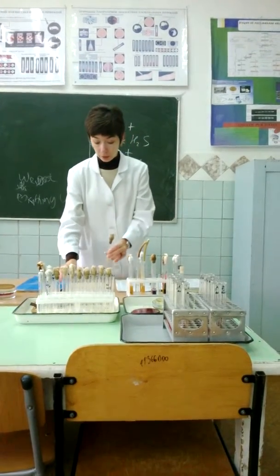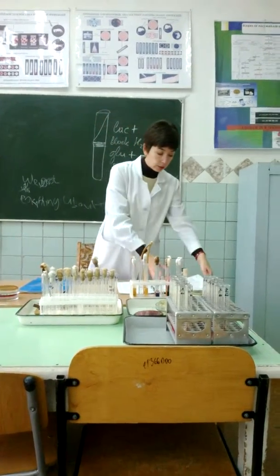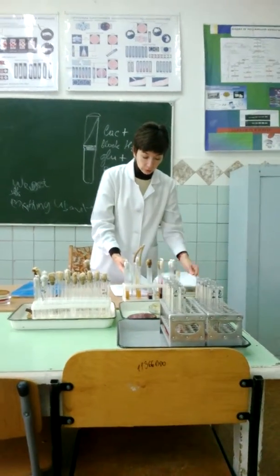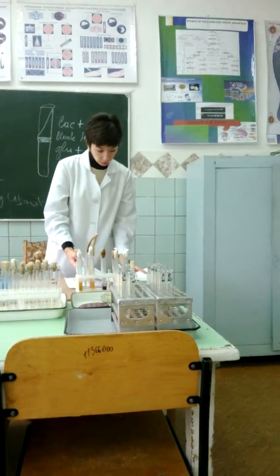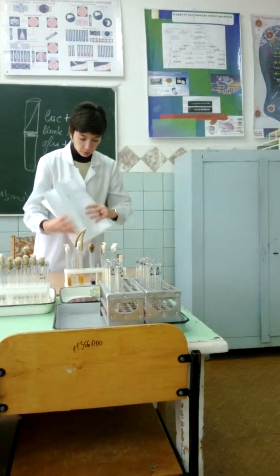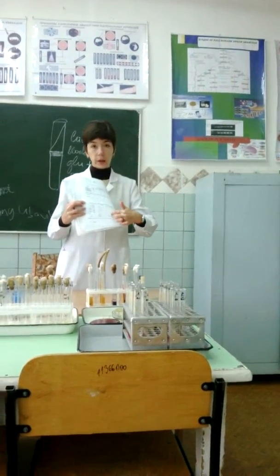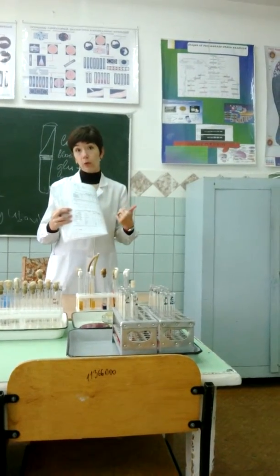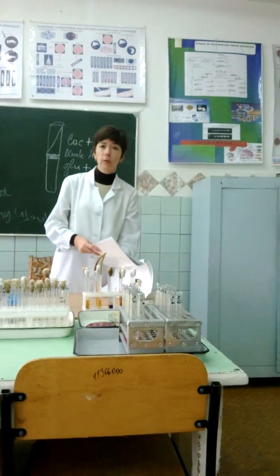It's a negative result. After this, the teacher gives you an identification table, as in your textbook, for Salmonella. By looking at which antigens are present, you identify which Salmonella is present. Is it clear? Yes or no?